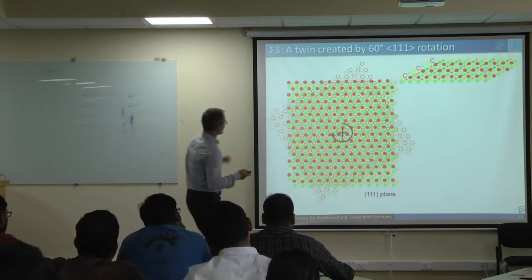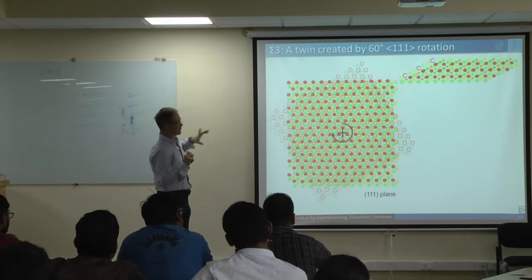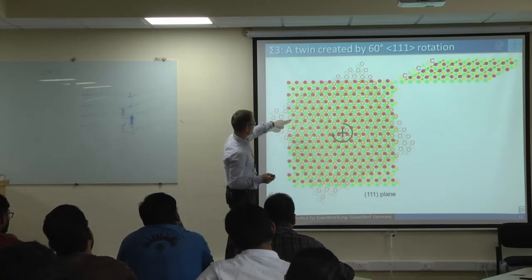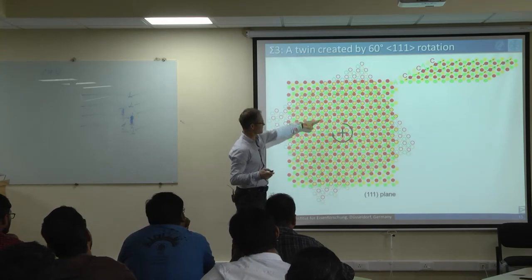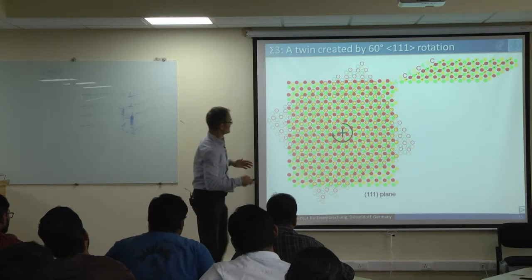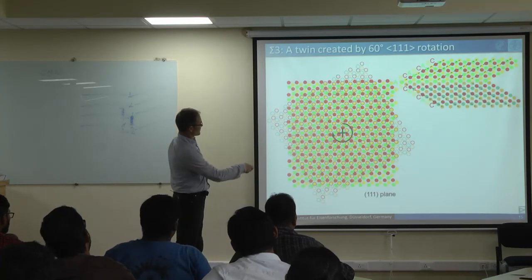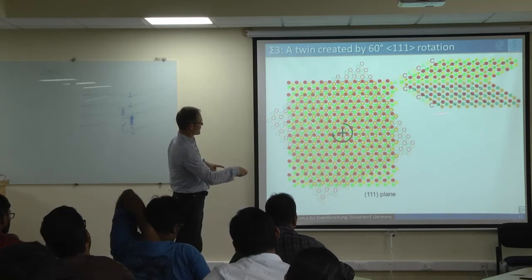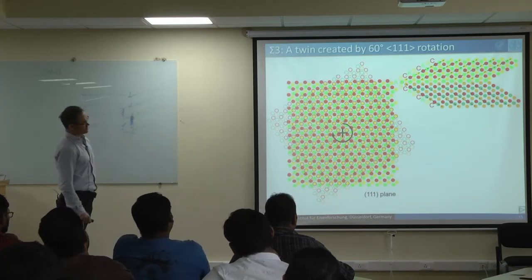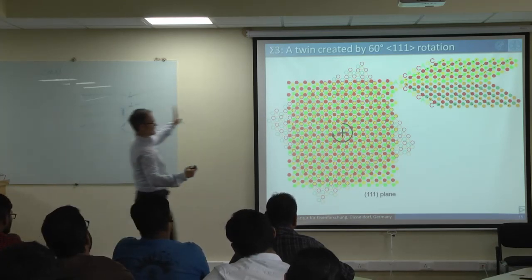And if we now look, where do the same colors fit to each other? Yeah? Then we see of the open circles and the closed circles, then we see actually the green atoms all fit perfectly to each other. And if we plot that here, actually the new turned layer with the open circles fits in this way to the, so this is a side view again.